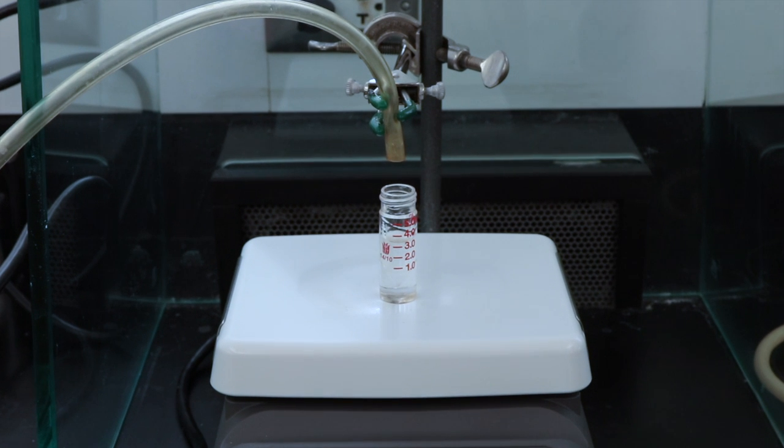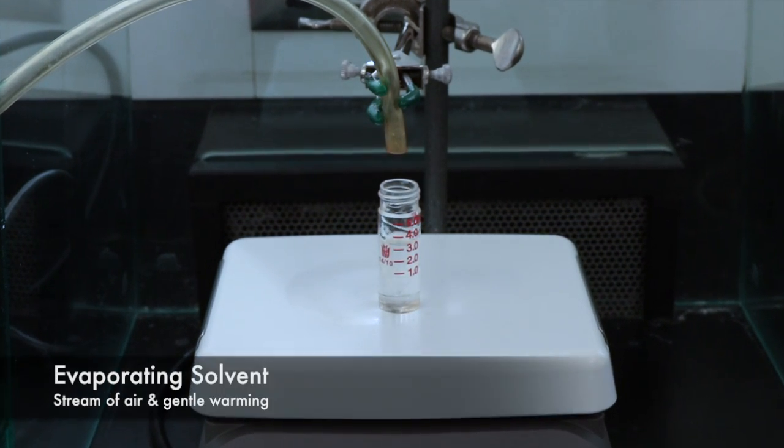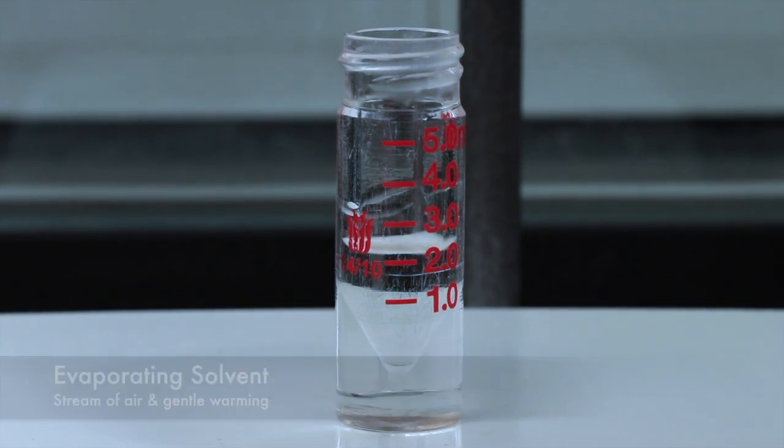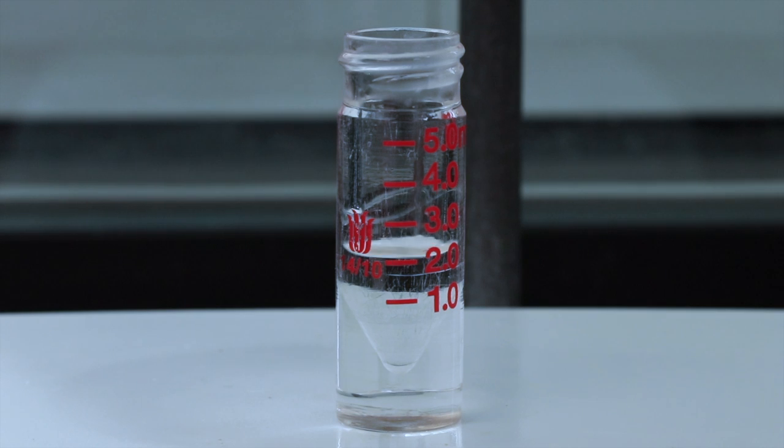Now that we have our dry organic layer, I can go ahead and evaporate the solvent using a stream of air and some gentle warming, which you can see the evaporation happening here a little bit.